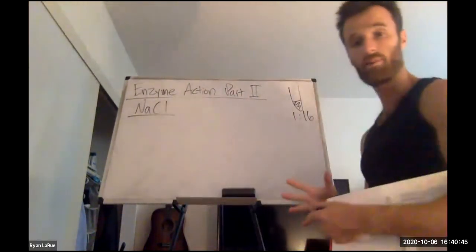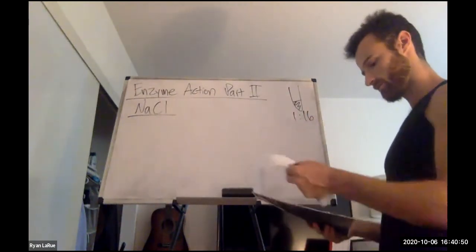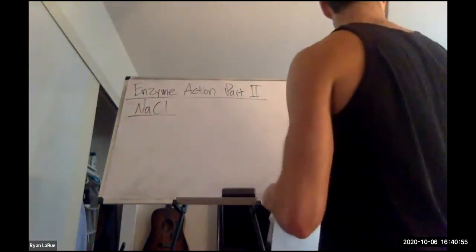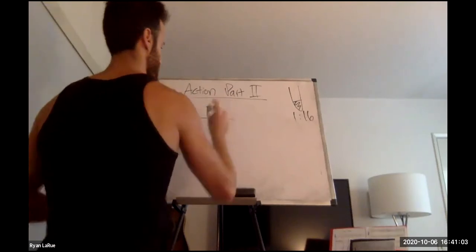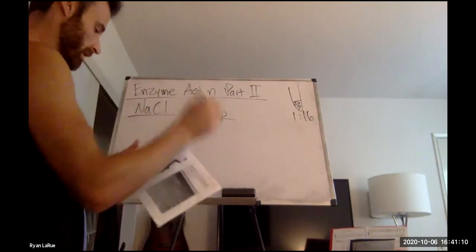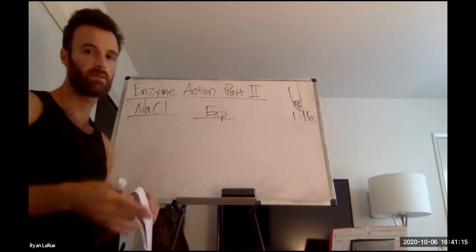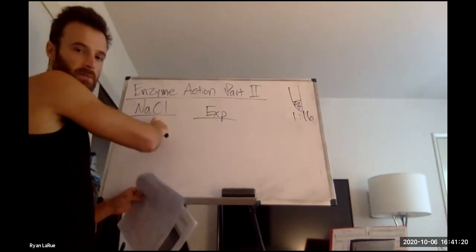Now, for setting up the NaCl experiment, you're going to test the enzyme activity in different conditions with NaCl.